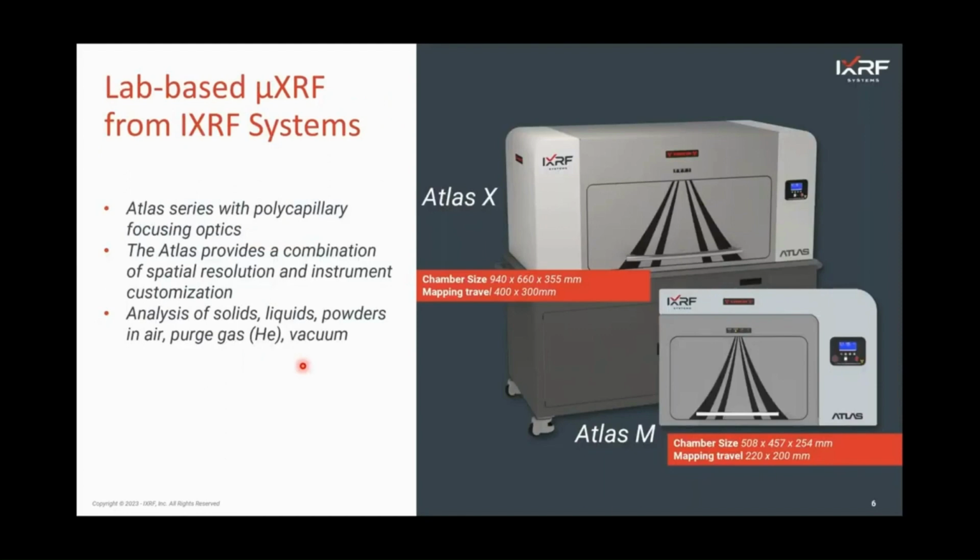So before we jump into comparative data between synchrotron XFM and lab-based micro-XRF, I want to provide a few slides describing what constitutes a lab-based micro-XRF instrument.